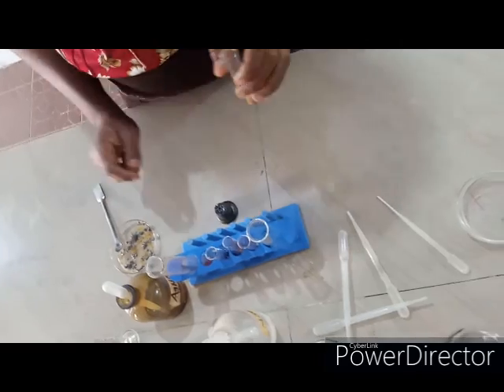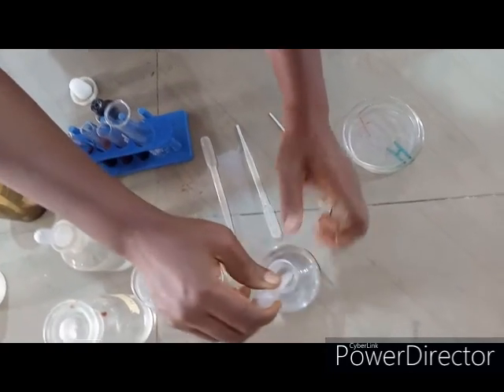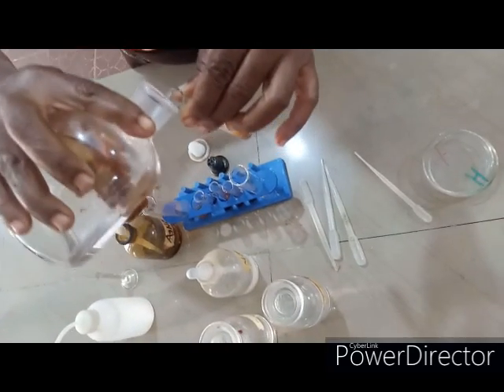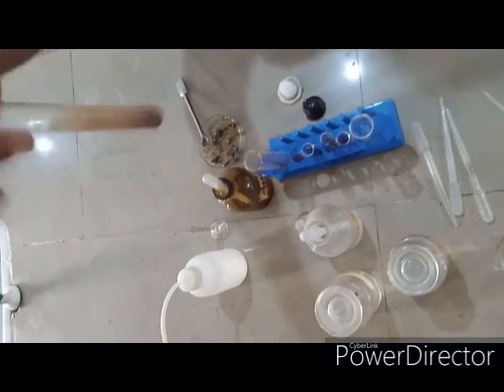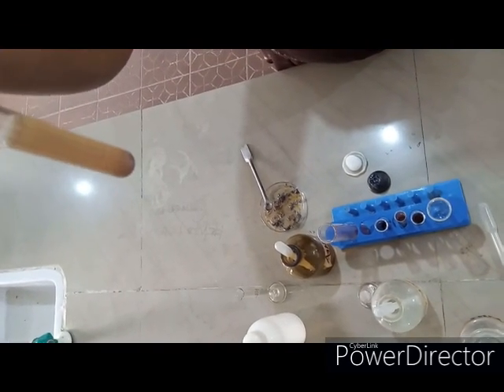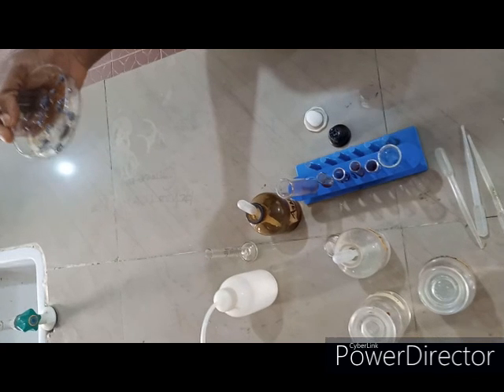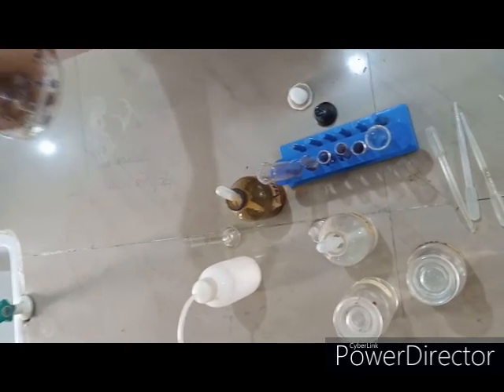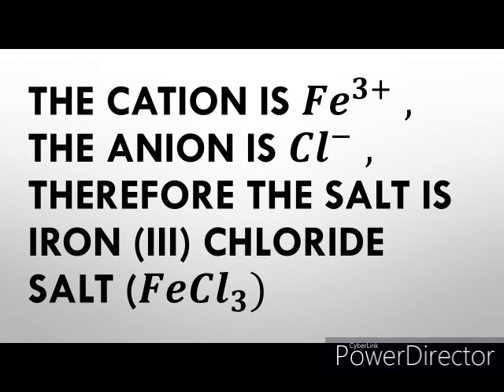Let's confirm which particular anion is present by adding trioxo nitrate 5 acid solution. Shake the solution to see whether Cl minus is present or trioxo carbonate 4 ion. As you can see, the white precipitate is still there. The inference is that Cl minus is present and not CO3 2 minus — if it were CO3 2 minus, the precipitate would have dissolved with effervescence. So iron 3 plus has been confirmed and chloride ion has been confirmed. When you interchange the valency, it gives you iron 3 chloride. The salt we've just analyzed is iron 3 chloride.